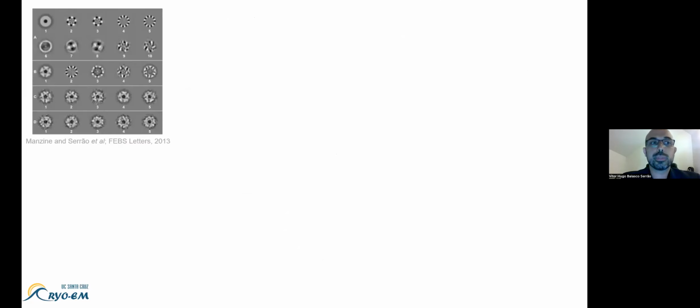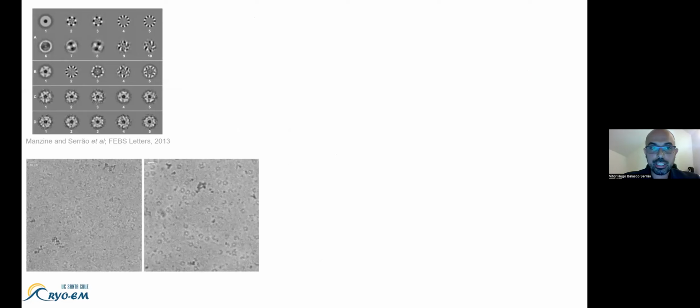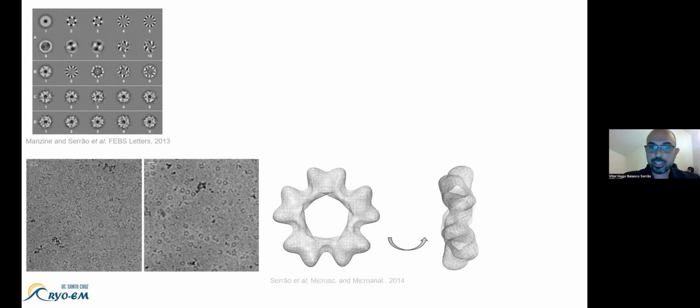So these are the results that we got like 10 years ago. We got excited, negative stain, everything looks good. We have a sample ready to go. So we have the perfect symmetry. So now it's just go for cryo, right? So the resolution revolution was happening. So we prepared cryo grids, we collected the data, we started processing, and I got my perfect blobology map at about, I don't know, probably 20 angstroms.